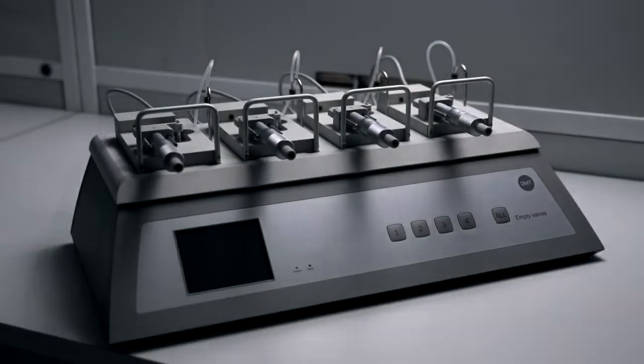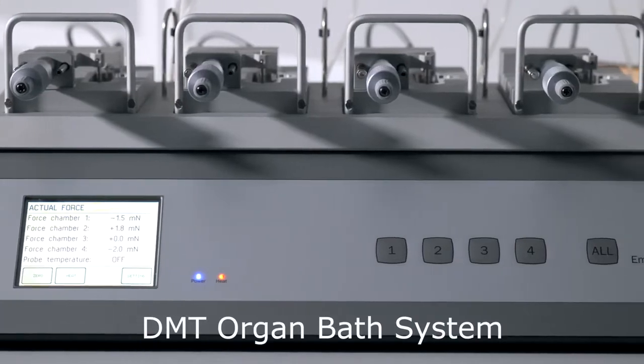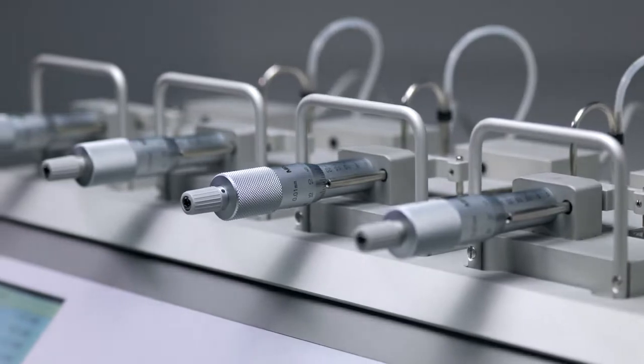The 820MO is a compact, reliable, and consistent organ bath system. It has been redesigned with updated features and capabilities from an existing system.